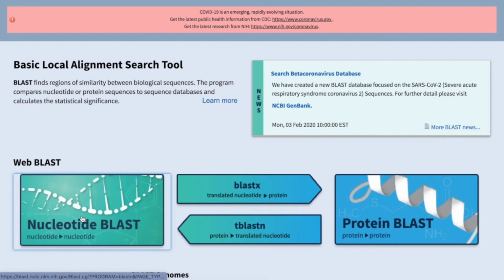engine. BLAST uses an algorithm to compare an input sequence to every sequence in the database. This process is usually called sequence alignment. It compares the unknown sequence with every known sequence in the database.